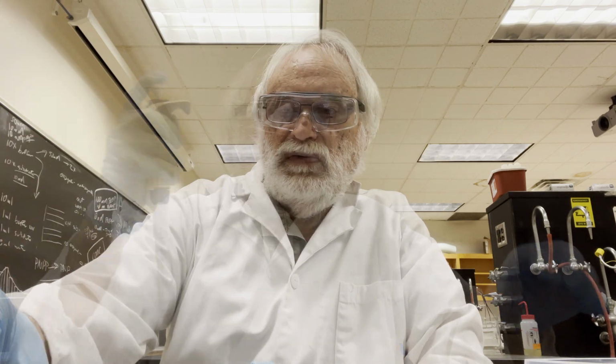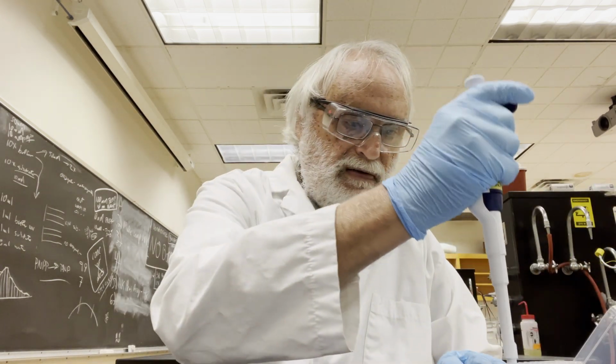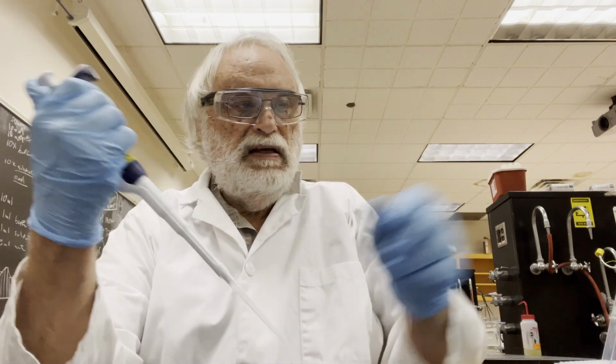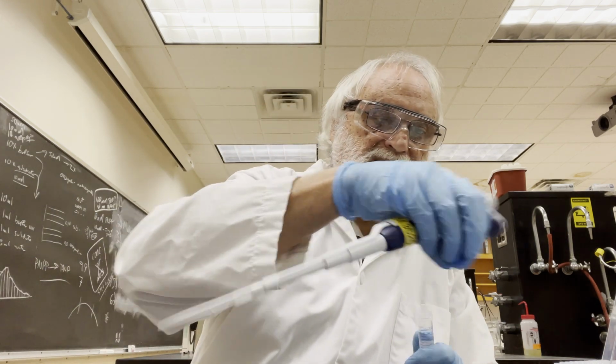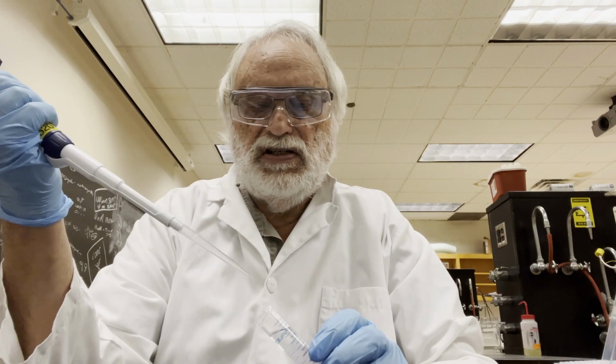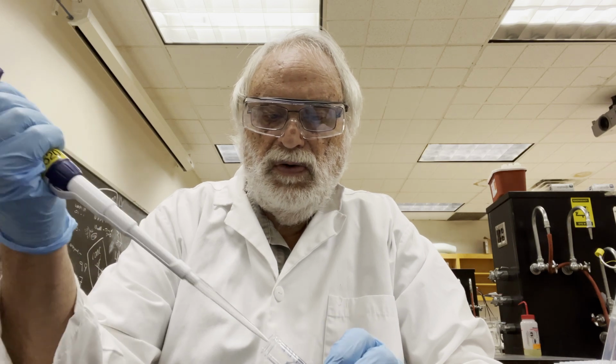What we'll do at first is add 700 microliters of our assay buffer to each of several tubes. So I'll go ahead and do that right here real quick.